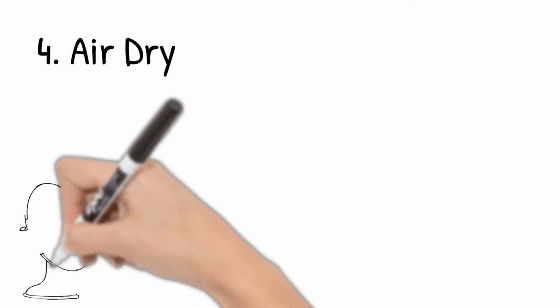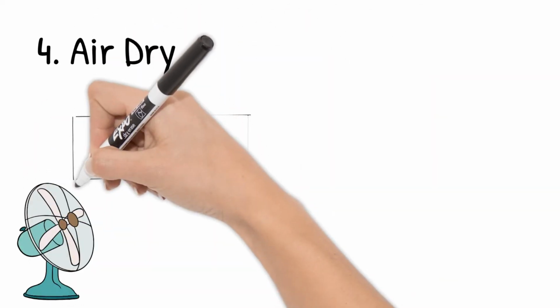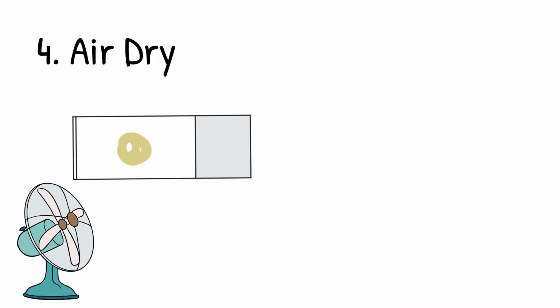Step 4. Let it dry. Don't make the amateur mistake. If you do not let it dry before proceeding to the next step, you will end up washing away the majority of it, if not all of the bacteria, by the end of the procedure.